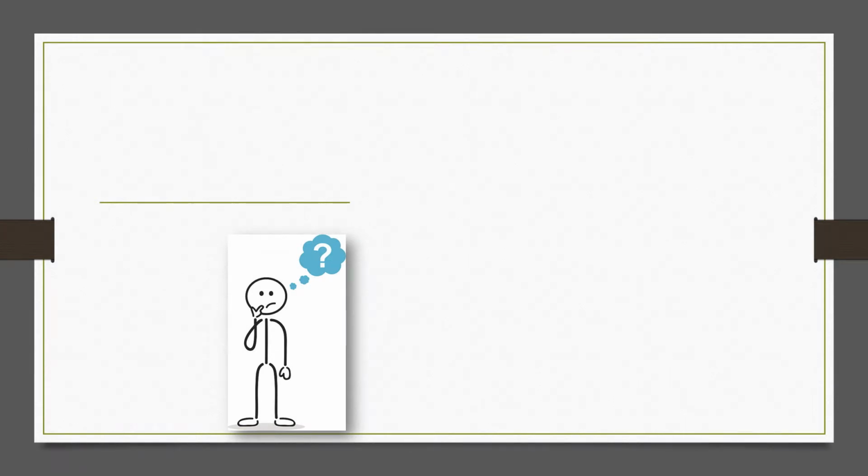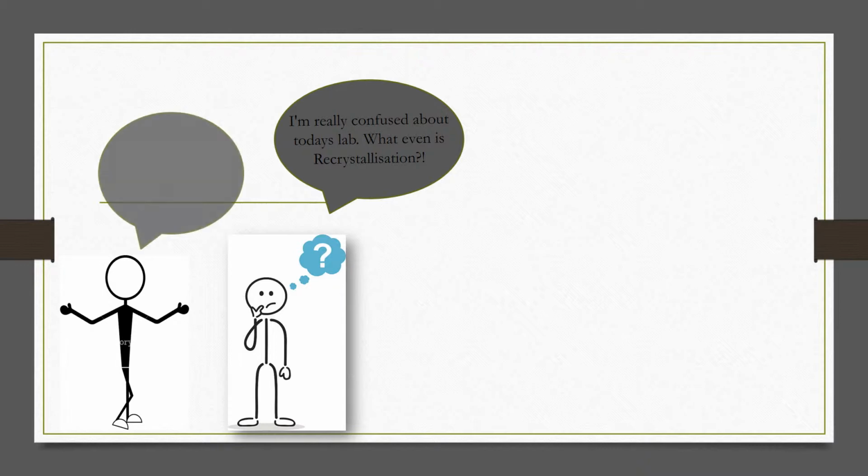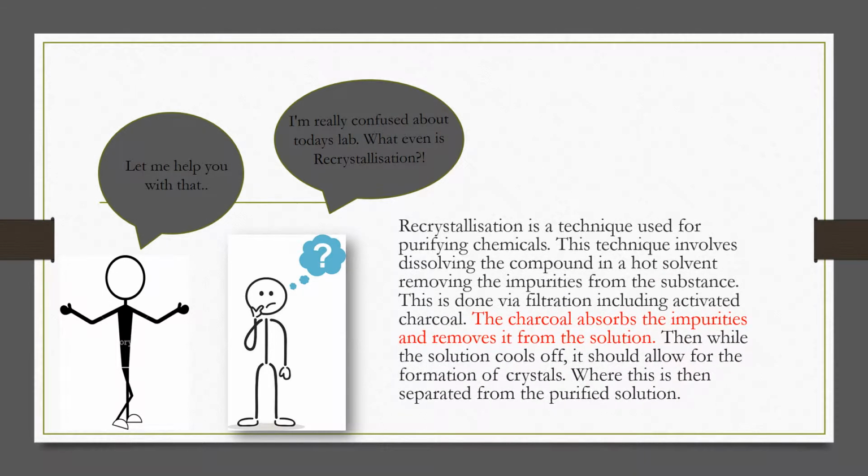What is recrystallisation? It can be a bit tricky to understand, but don't worry, I can help with that. Recrystallisation is a technique used for purifying chemicals. This technique involves dissolving the compound in a hot solvent, removing the impurities from the substance. This is done by filtration, including activated charcoal. The charcoal absorbs the impurities and removes it from the solution. Then while the solution cools off, it should allow for the formation of crystals, which are then separated from the purified solution.